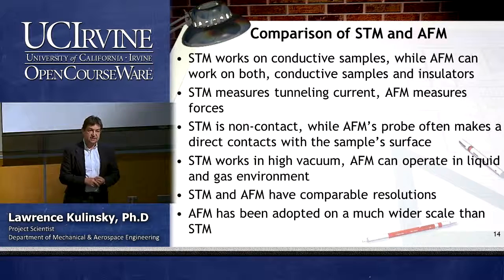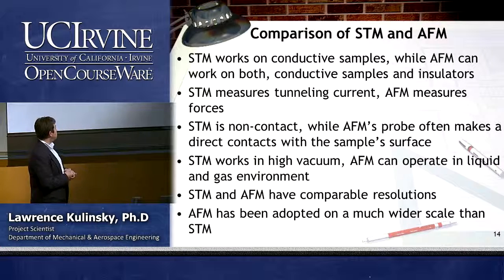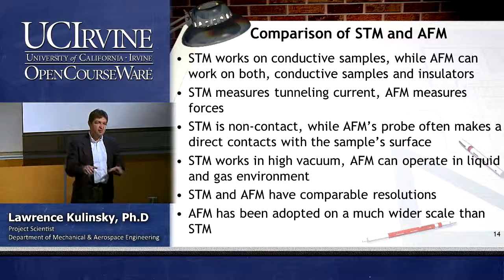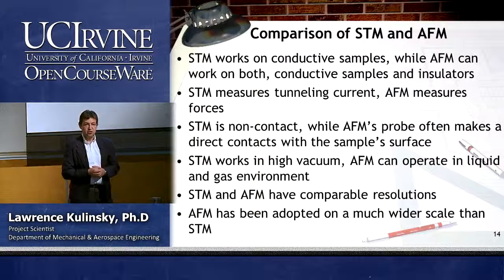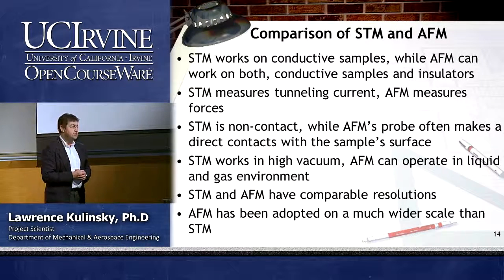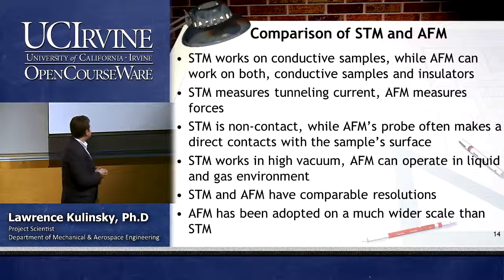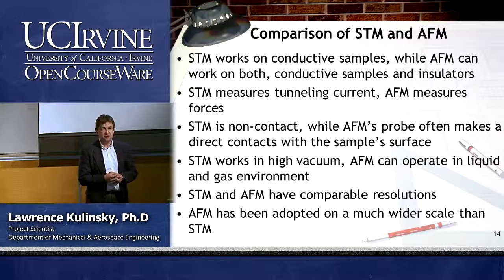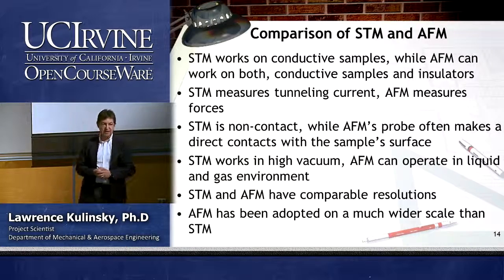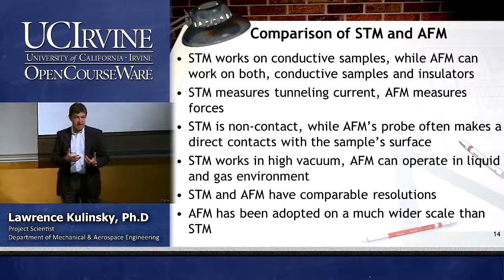This is the big one. STM works in vacuum, which basically limits somewhat its usefulness. Well, AFM can operate in liquid and gas environment. They both have comparable resolution. If resolution is your goal, people actually prefer STM still. And for another reason why STM is so cool, we will touch on it later in this lecture. And as a result, AFM has been adopted on much wider basis. So now more universities and corporations have AFM than STM, even though AFM was invented, as we discussed, later.